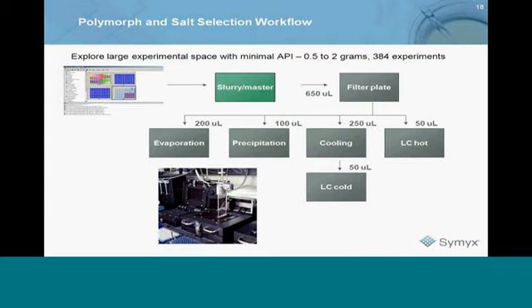Well, so I would say that we do, the scale up, we generally do pretty well in terms of scaling up to the many milligrams. So I talked about in the case when we do scale ups for verification, our scale ups in this particular context are still quite small. I mean, we're still talking about going from a 1 to 2 milligram scale to a 25 to 50 milligram scale. That's still a very small amount of material.